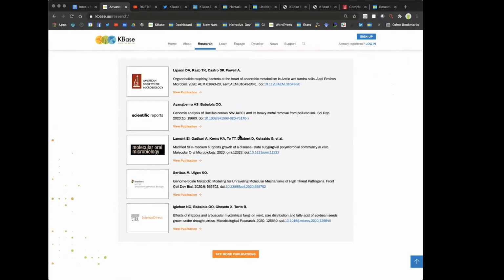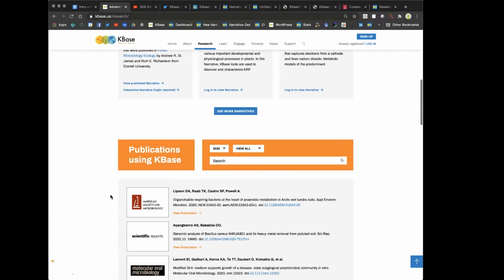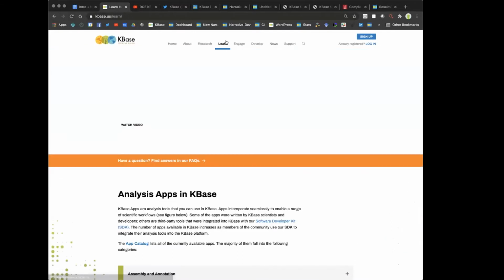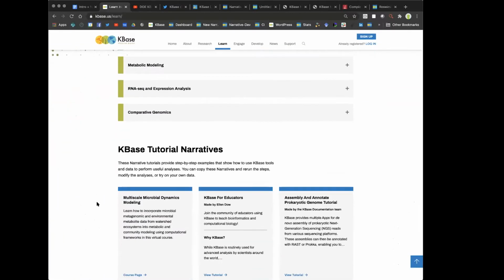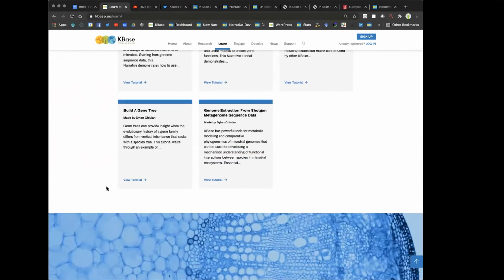We try to keep a running list of all of the publications using KBase there as well. The Learn section has information about various analytical workflows in KBase, and different kinds of resources like tutorial narratives, etc., for you to learn how to use the system.